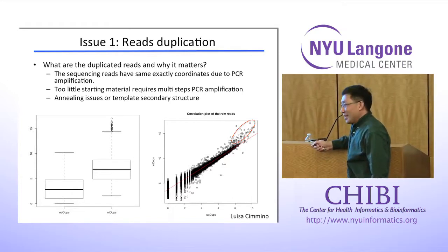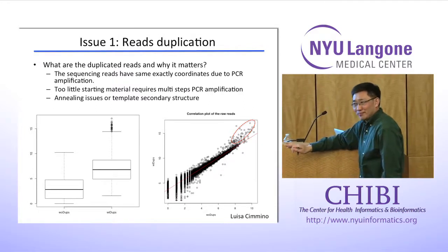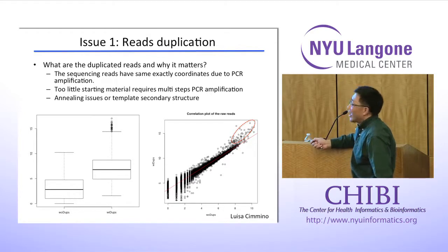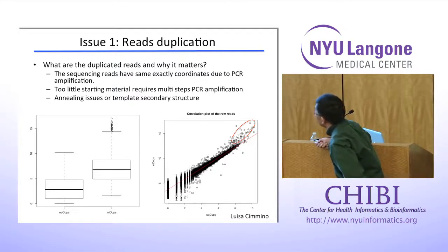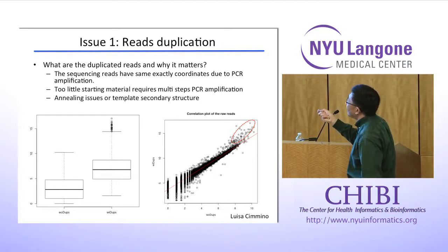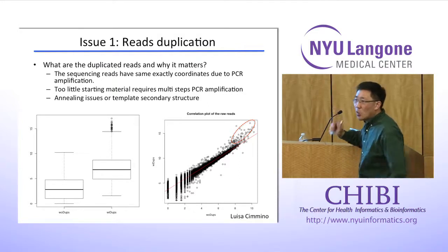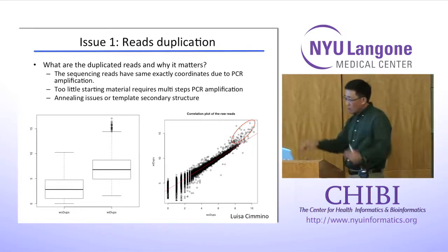If this lifting is proportional and linear, it won't be a huge problem. However, if you do the correlation plot, duplication kept versus duplication removal, you always see a group of reads which are off the trend line. That's why when I do the RNA-seq analysis, the first thing is to remove all these duplicates.